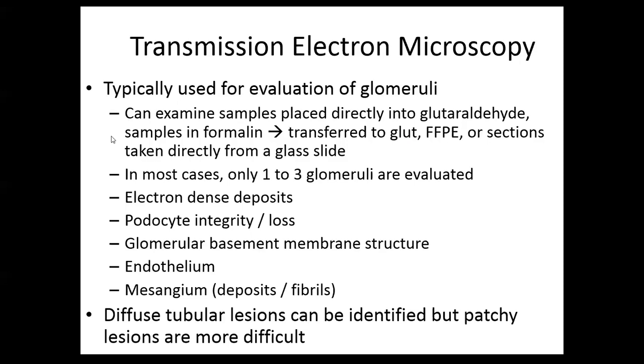In many human diagnostic labs, that's what they prefer to do, most of the time because it makes it easier for the clinician. The clinician only has to put one sample into formalin, and then we're the ones that decide which one goes to glutaraldehyde. So oftentimes that's what it is. And we'll hopefully be able to transition to that with our veterinarians. Our veterinarians that use us are very used to having 3 vials now, and so we don't want to drop a whole bunch of change on them at once.